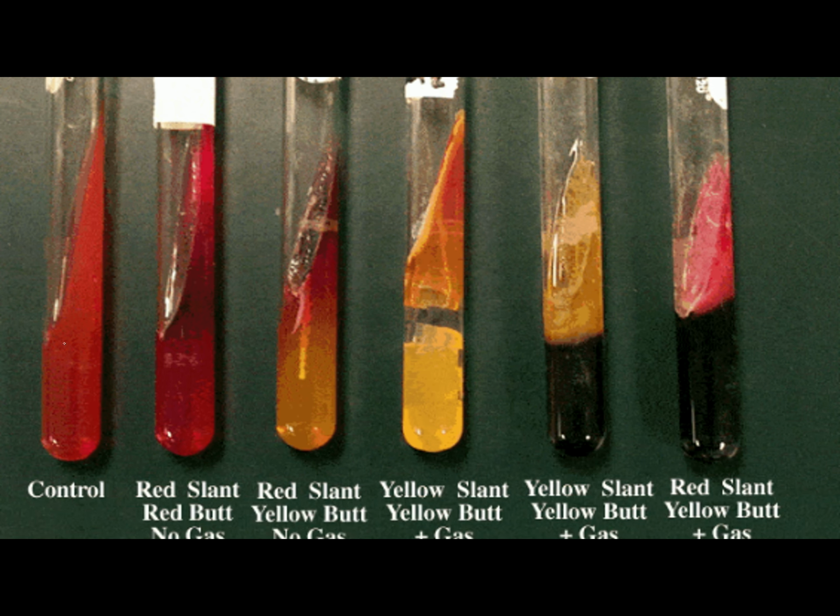So let's go here. In the first tube, class, this is a normal TSI. Kulay red siya. If you take a look, the slant is red. So that's K over K kasi pareho silang alkaline. You take a look at this second picture, same din. Red slant, red butt, no gas. So K over K. If you take the third tube, red slant, yellow butt. So you would write that as K over A. Yellow slant, yellow butt. So this is A over A. And if you take a look, there is cracking of the media, meaning this is positive for gas production.